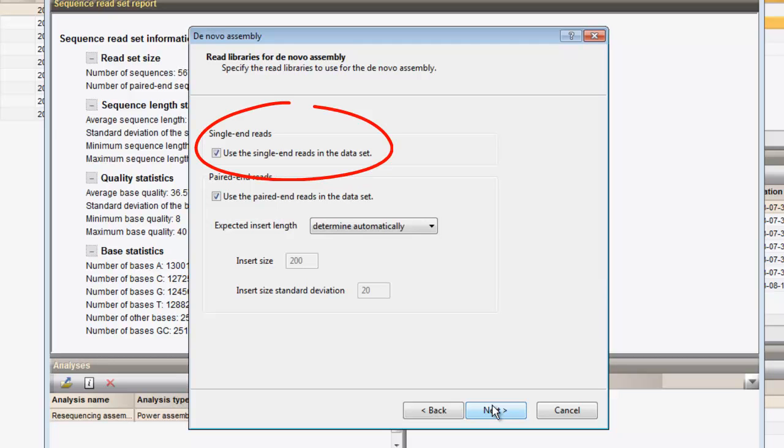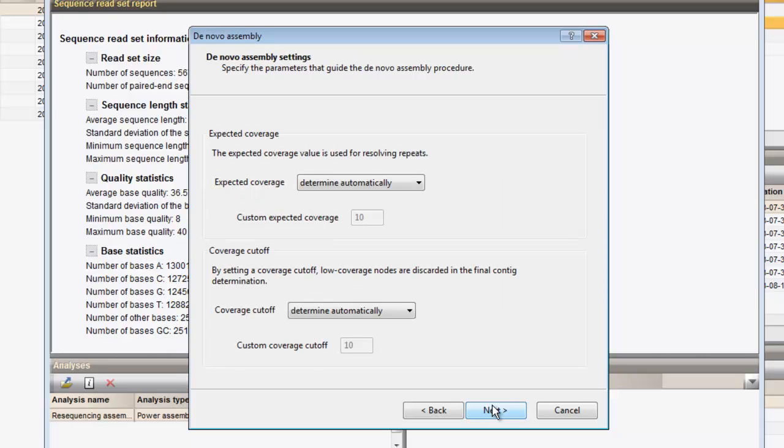In this case, only single-end data is present in this dataset, and as such, we don't need to alter these settings as no paired-end reads will be picked up by the algorithm. To resolve repeats, Velvet uses specific parameters based upon k-mer coverages. The coverage cut-off values can be defined on this page of the wizard. By default, the expected coverage and the coverage cut-off values are determined automatically.